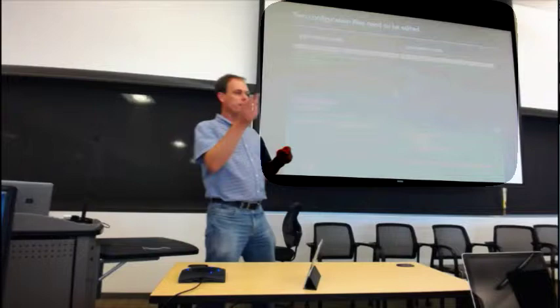So in the like slash scratch slash HDF5. Yeah. In our case, the tarball just attached to the Cheetah. No, you leave the Cheetah there. You just have to add your private directory. But that HDF5 directory does not exist in our tarball? Okay, then make HDF5. Yeah, it should be there. I might have copied and forgotten to create it somehow. Because I just did it. You just did it. Okay.